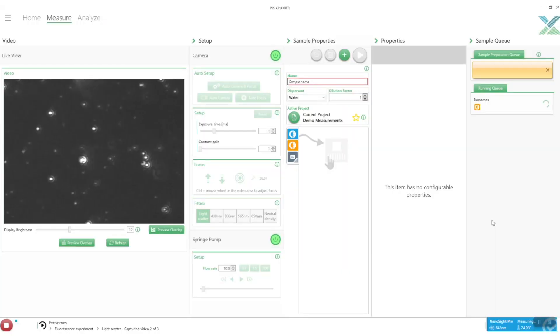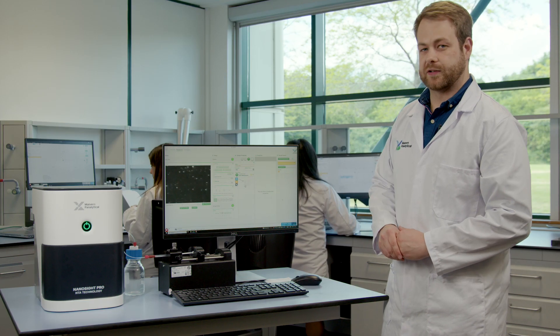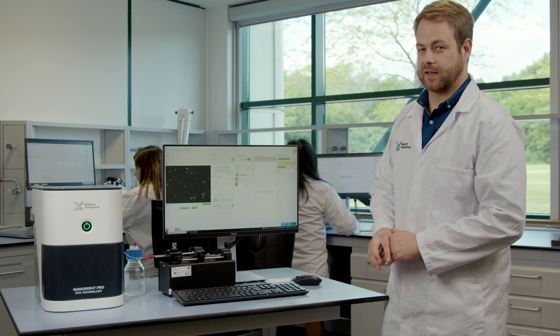Now we're just going to change our number of captures down to three and then we can click play and the measurement will run. It's going to start capturing so you see this green progress bar going along and it will go through three captures and each time in between the captures it flushes sample through ensuring that the sample is not going to be photobleaching during the measurement.